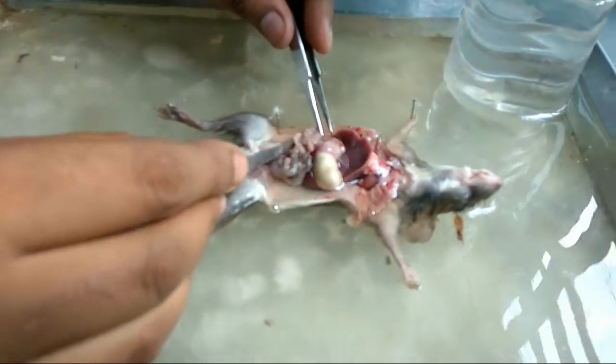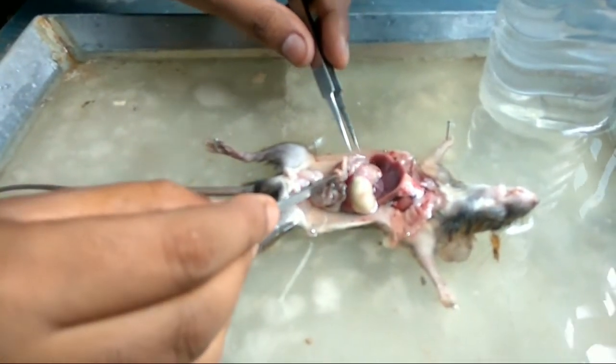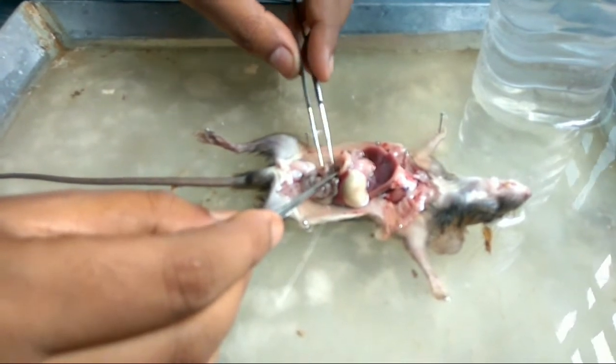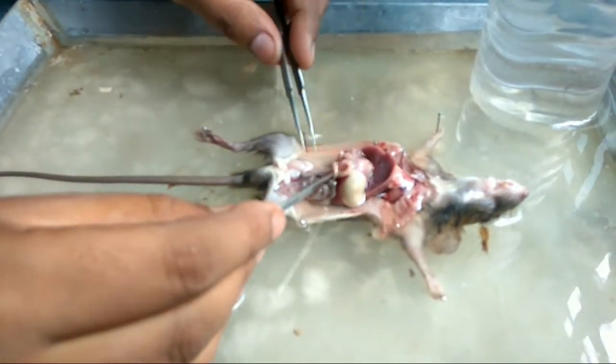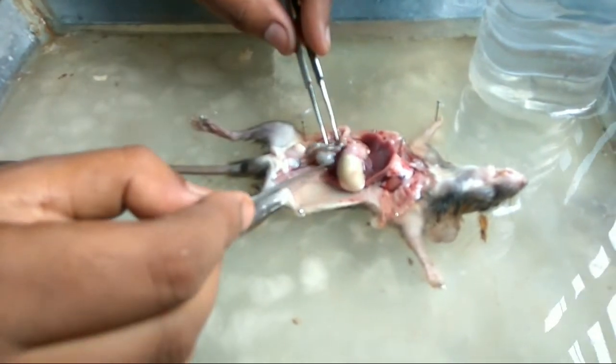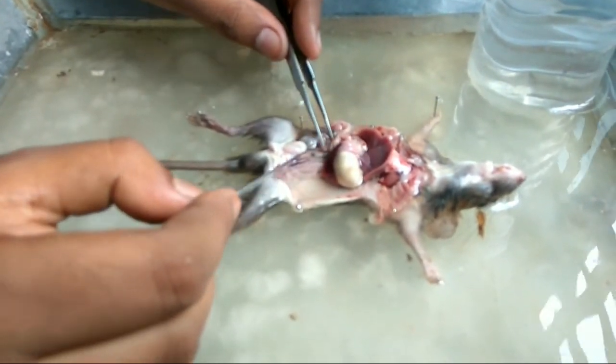I think this is the testes and this is the urinary bladder. The testes normally remain in the scrotal sac, but somehow one of them came up into the abdominal cavity in this case. Now I will show you the kidney.